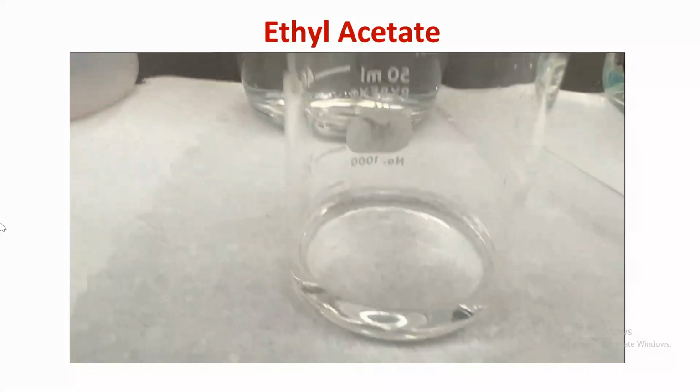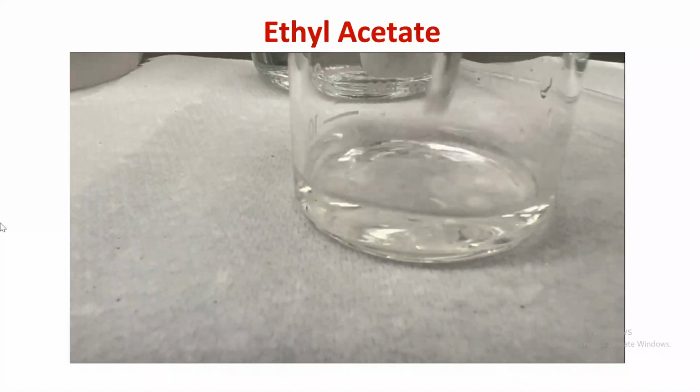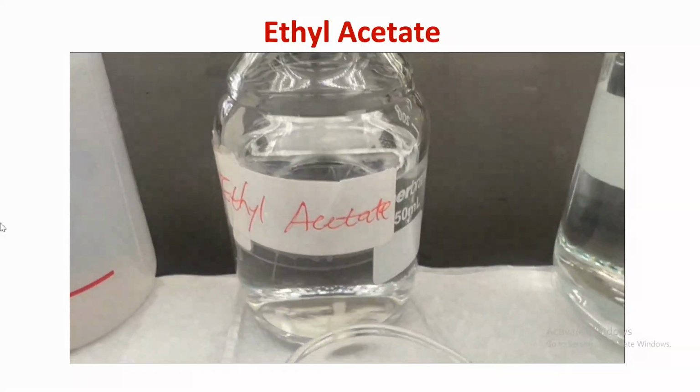Before we can make any judgment, let's stir it up. All right, this is a little different now. Now, this actually, it was two layers. When we go back at the very end to show you, ethyl acetate actually makes two layers with water. It might be hard to see because both liquids are clear, but ethyl acetate actually made two layers.